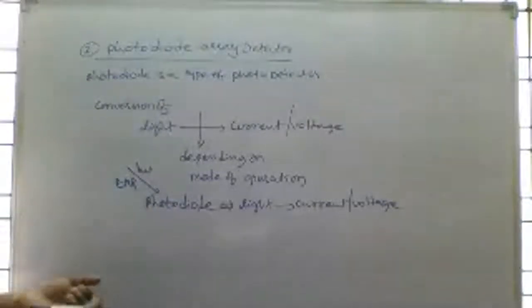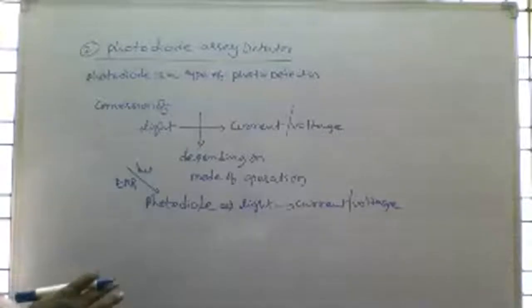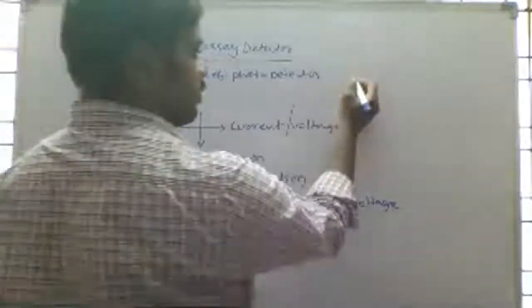So here is the photodiode symbol. This is the symbol for the photodiode.